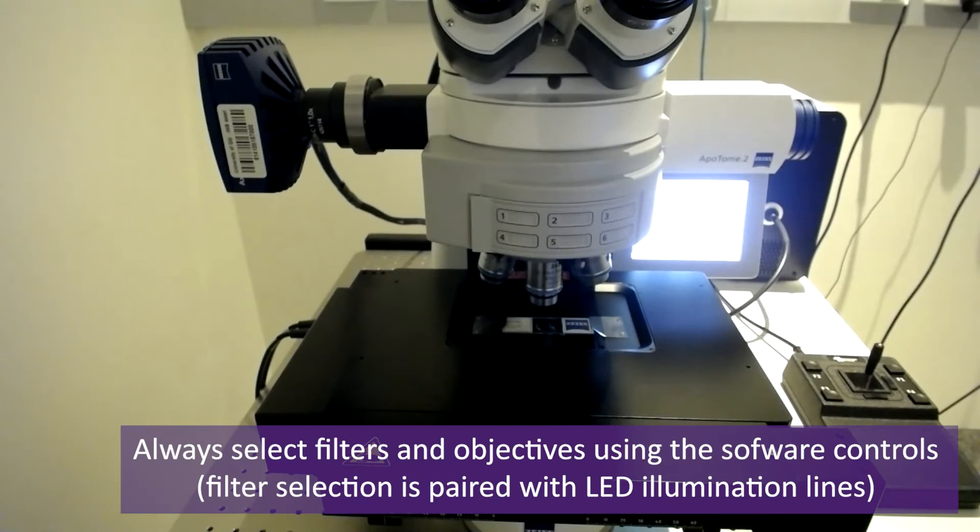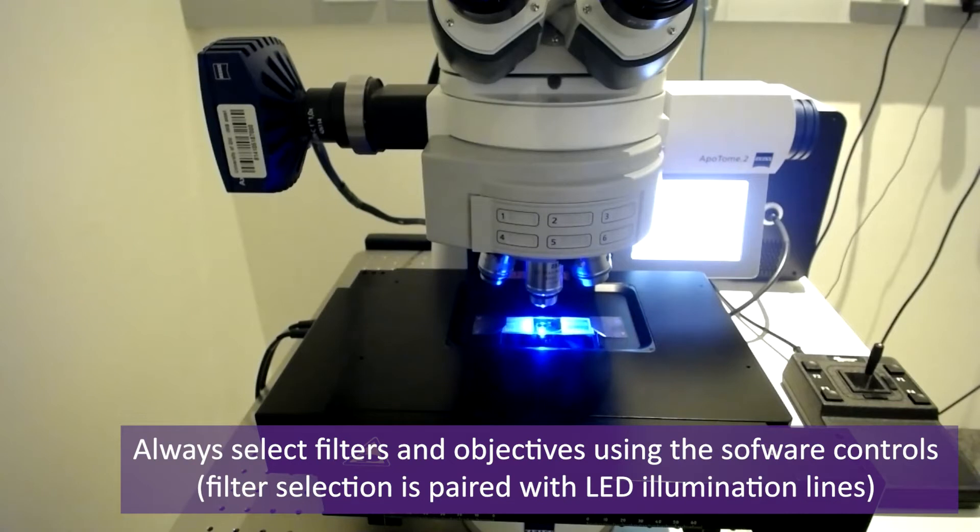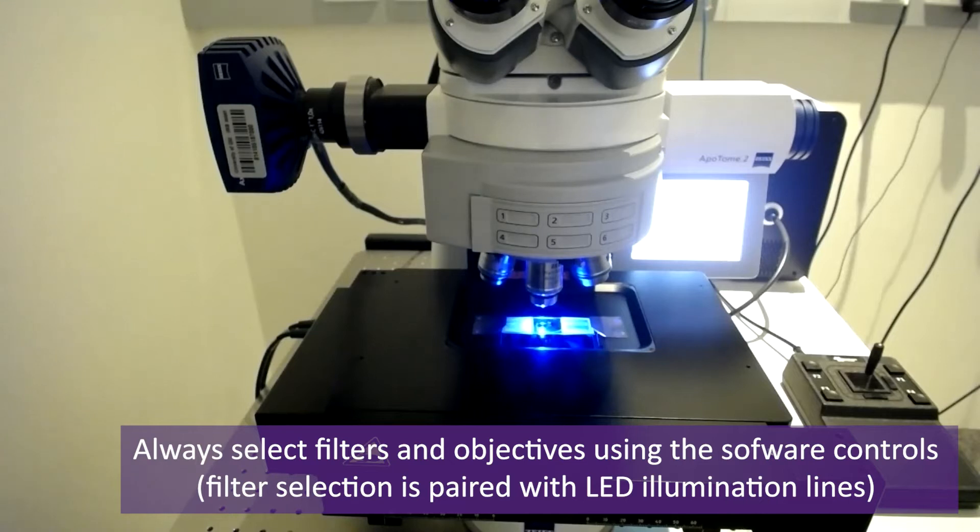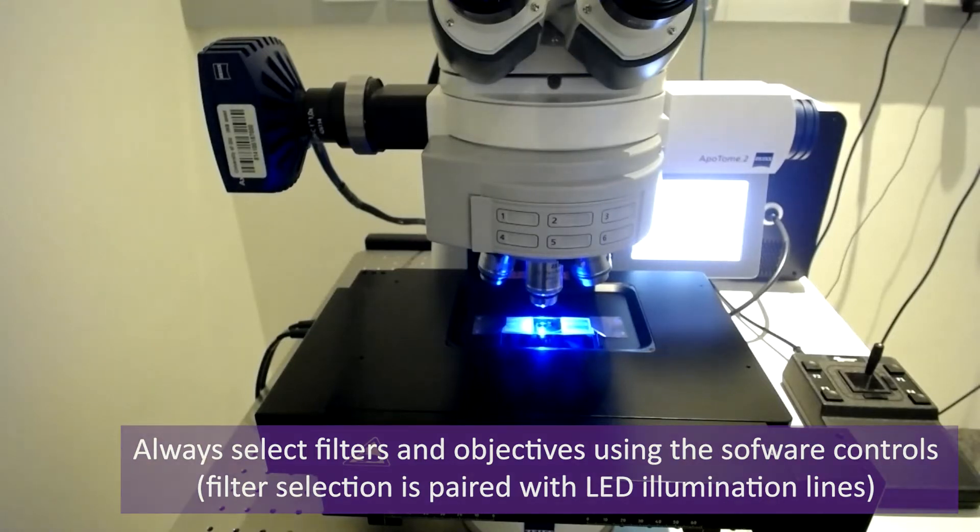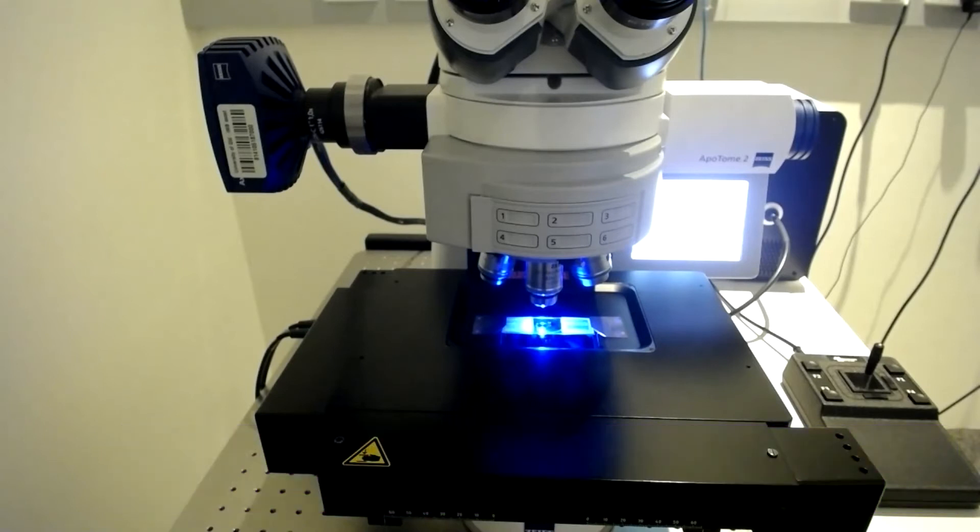This sample is fluorescent in the blue, green and red channels. Using the software favorite channels, I can select the GFP filter and the live button, which also turns on the relevant LED illumination line in order to excite the sample.